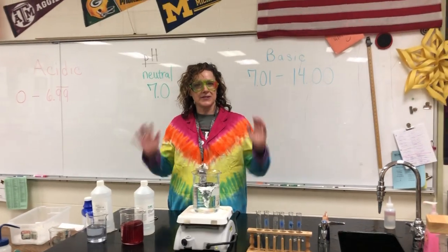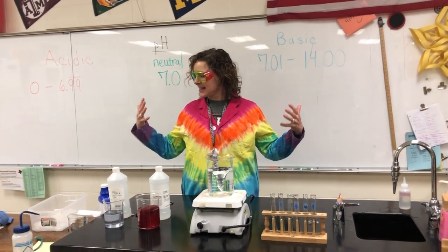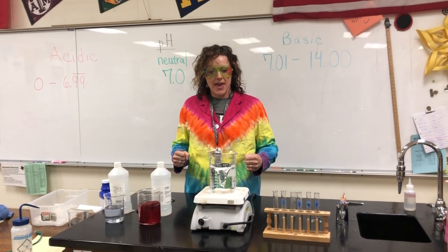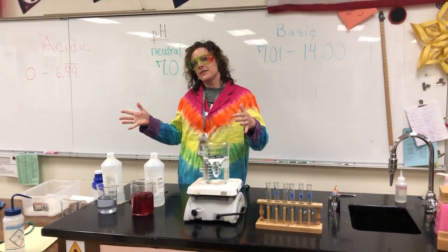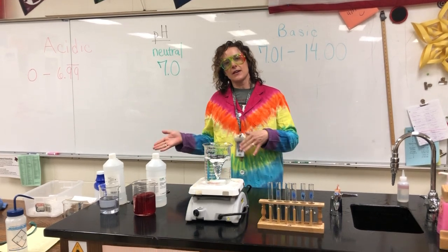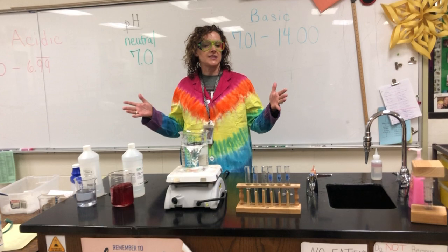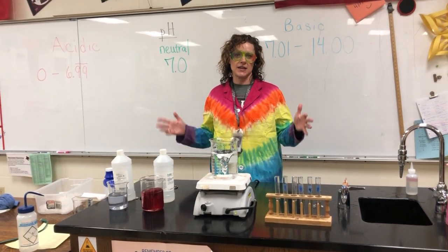So today we're learning about the pH scale. Again, these are things I wanted to do here in school because they're a little hard to do at home. And I'm going to be doing some other lessons to help you understand how we calculate pH and what that means. But I wanted to introduce this awesome idea of pH indicators.